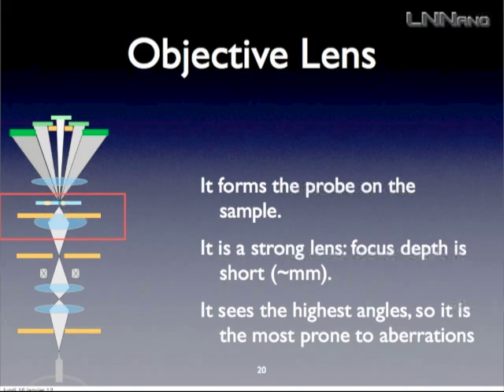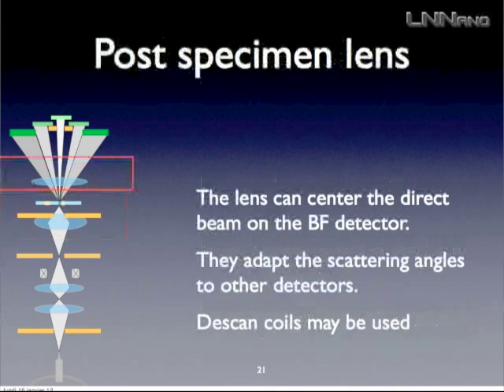And after the objective lens, in the early days of STEM, and there are still STEMs like that, you don't really need to have optics. Because now you want to make so many things, you want to work a little bit to design the shape of your beam after the sample, because you have many uses for it, but you don't really need it.